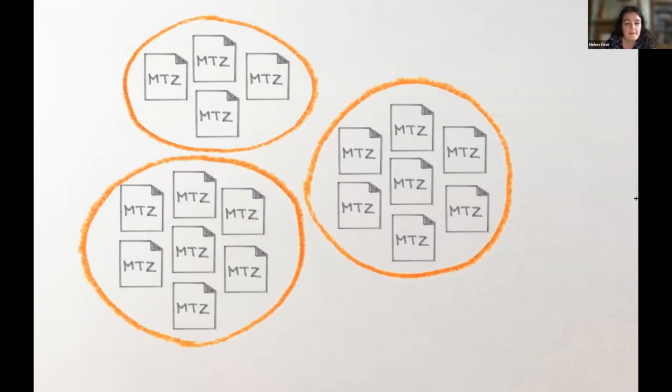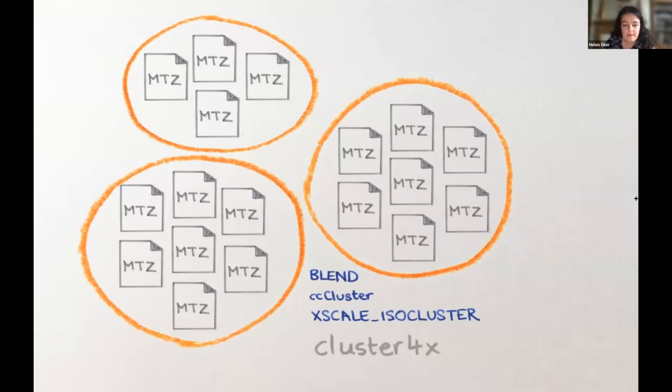But Cluster4X actually had uses that extended far beyond that, but I'll first explain how it worked for reflection lists. There are a number of clustering programs already available, so why did I decide to write another one? This is because I wanted it to be fast, really fast in real time, so that people could interact with it graphically. So it has a graphical user interface, and I wanted people to be able to really explore their data sets and get to grips with the pathologies within the data sets as well.